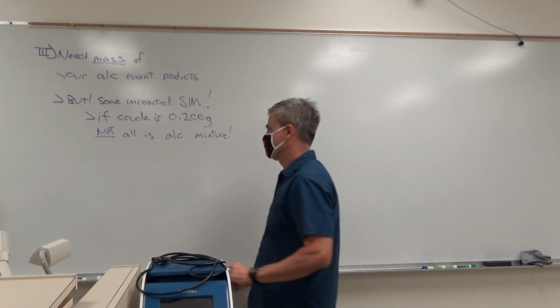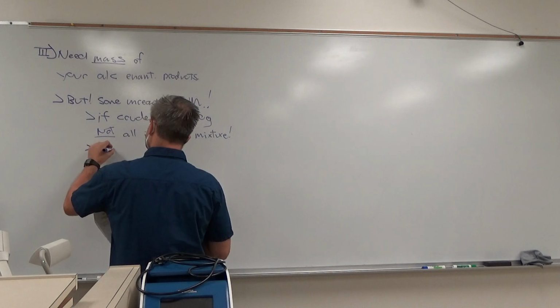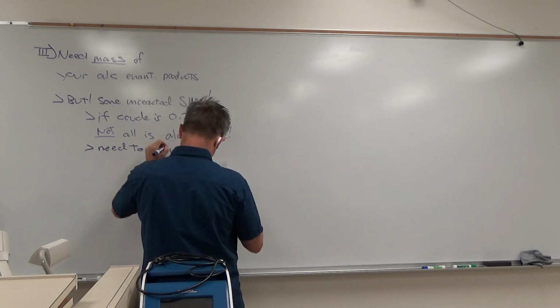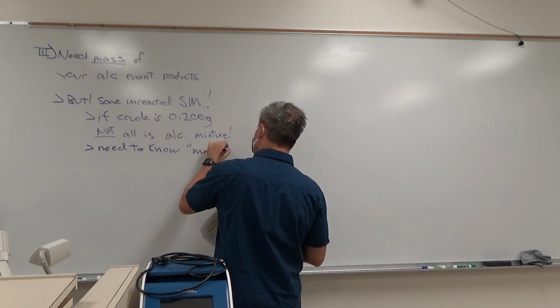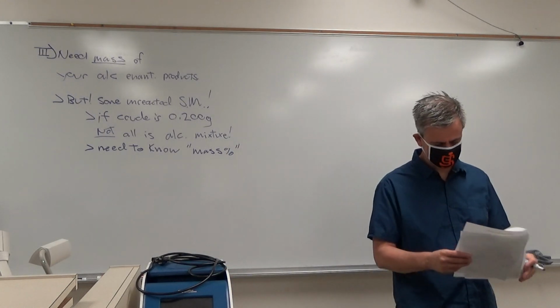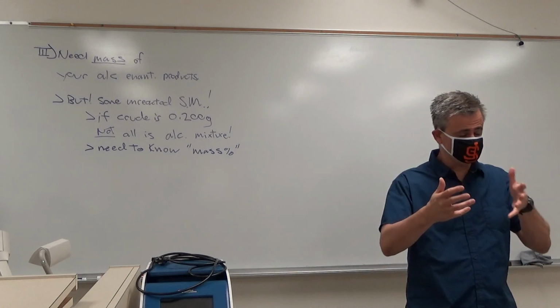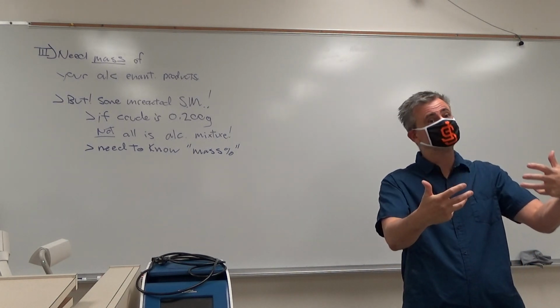Okay? No, mass percent. Okay? Whew. So NMR, if I compare the signals for the starting material and the product, will tell me the mass percent?